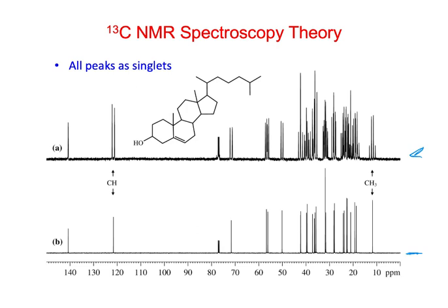But if we had a small quantity of sample, like I used to do doing natural products chemistry, you'd isolate some small amount of material, and you may have to run your C13 overnight or longer to get enough signal to noise to be able to pick the peaks out.